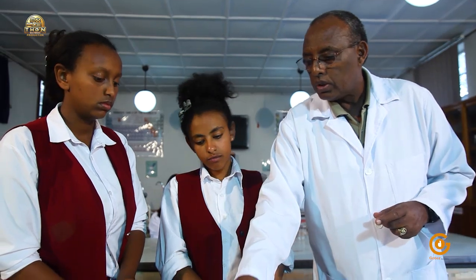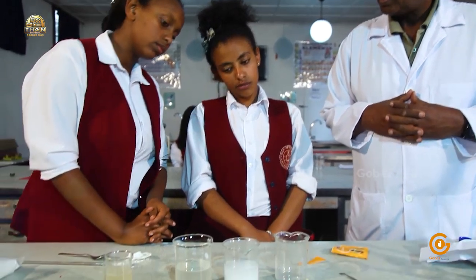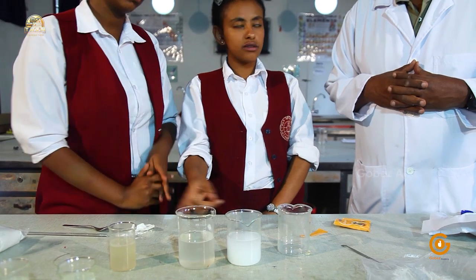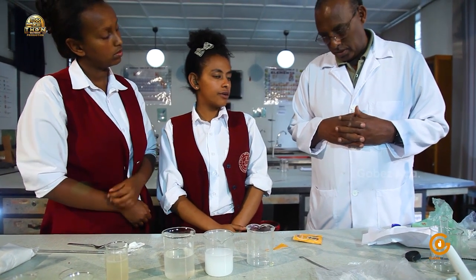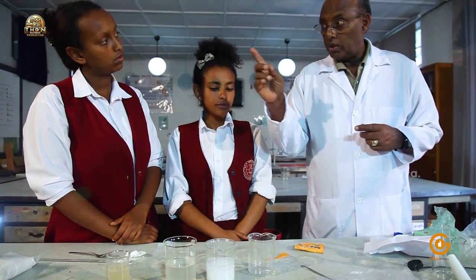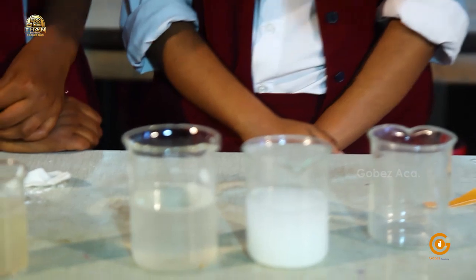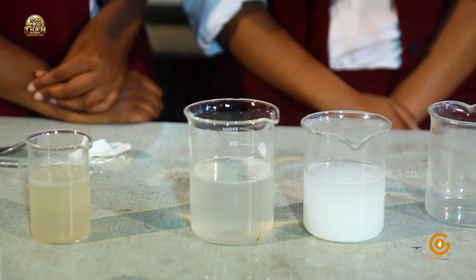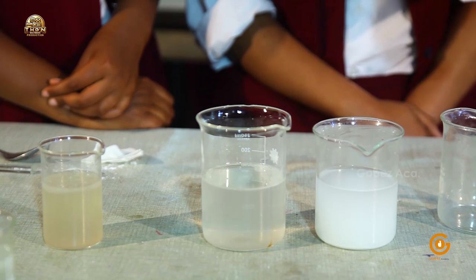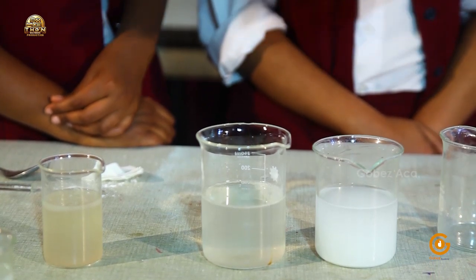How about sodium bicarbonate? I think it's the same as sodium chloride, because they are ionic. But as you rightly said, we saw gas coming out, effervescence. Carbon dioxide is a product, so it was a chemical reaction, not mere dissolution.